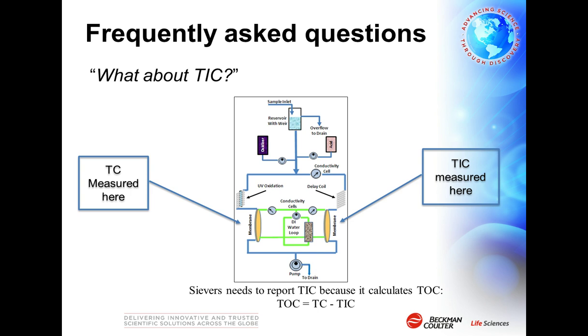So TOC analyzers use 2 separate sensors to measure TIC and then total carbon, and can suffer badly in samples containing large amounts of TIC in the form of dissolved carbon dioxide. And in fact, that's very common, especially in purified water samples.